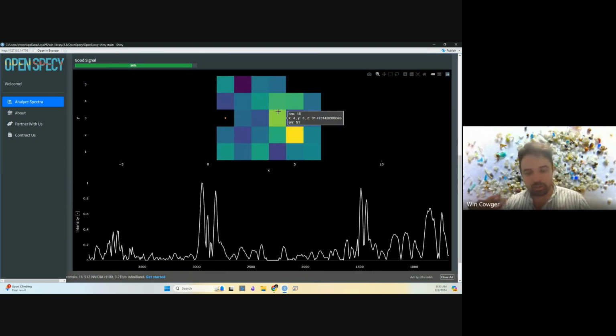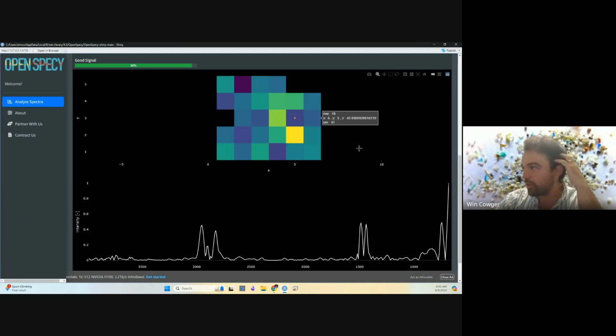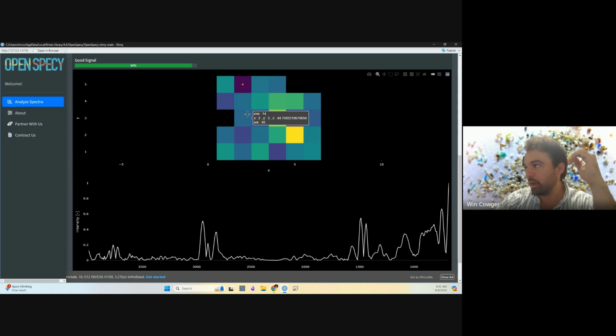When you're doing batch analysis, you really want to look at the big picture of your spectra. I'm clicking around, asking, do I see any artifacts that are consistent? I'm seeing another one over here in the lower region. I'm seeing a big spike, basically a baseline spike, and I do not think that is actually part of the signal I'm looking at.